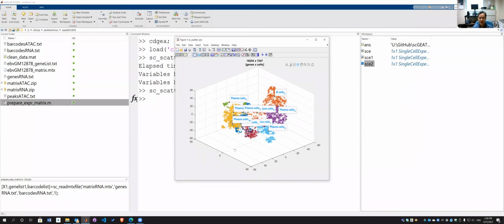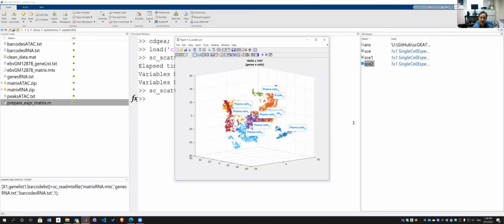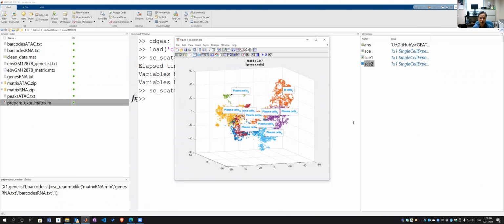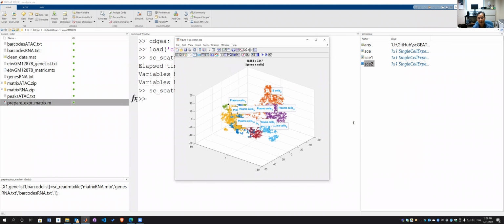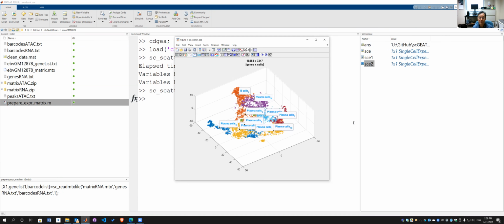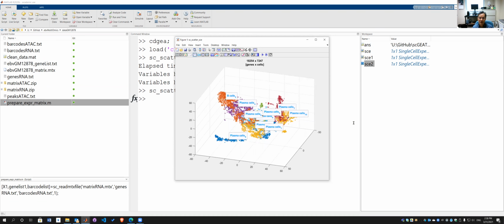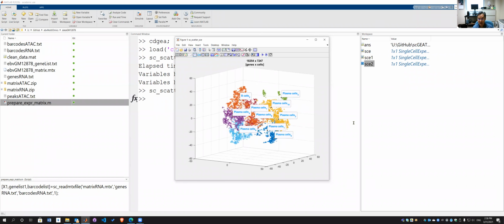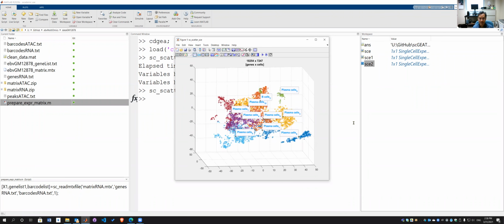To visualize this, you can click this button. I want to make a video snapshot, to make an MP4, a short video, to help people visualize if other people don't have this MATLAB environment. You can share the MP4 file with them.